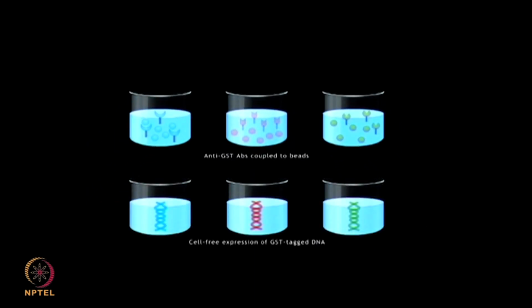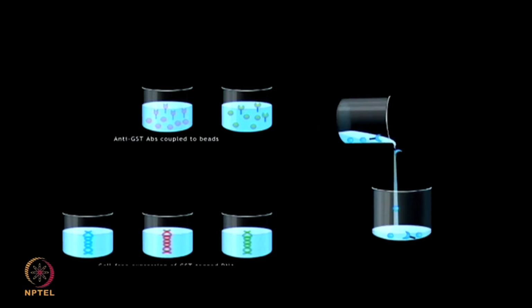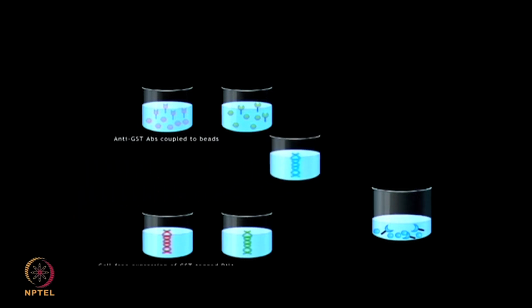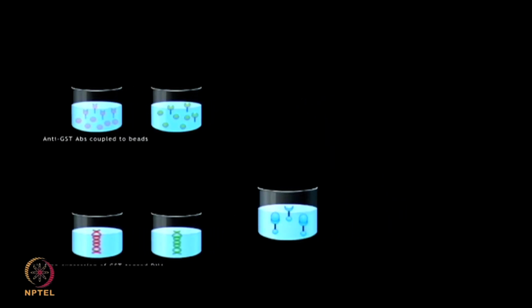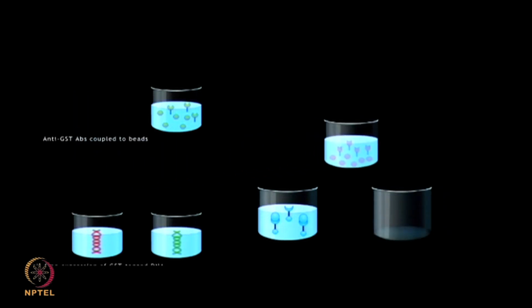In this study, the authors developed a programmable multiplexed immunoassay where tagged antigens were expressed by using in vitro transcription and translation, and captured these onto anti-tag coated beads.